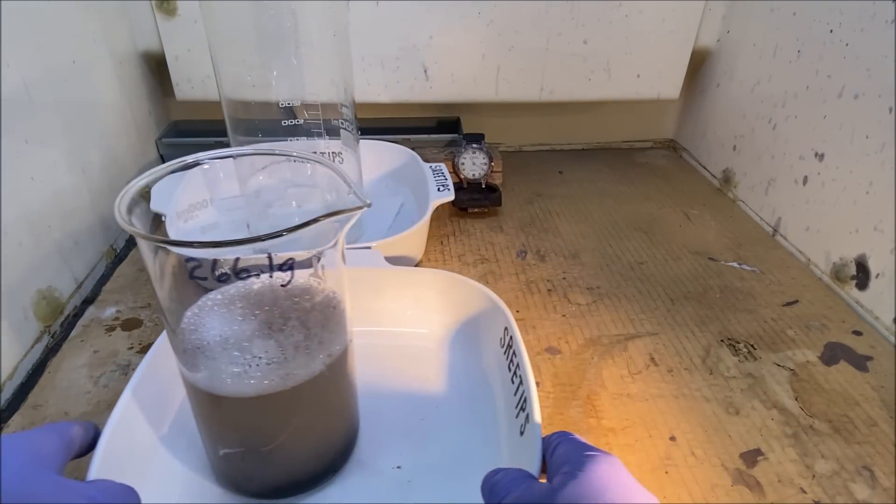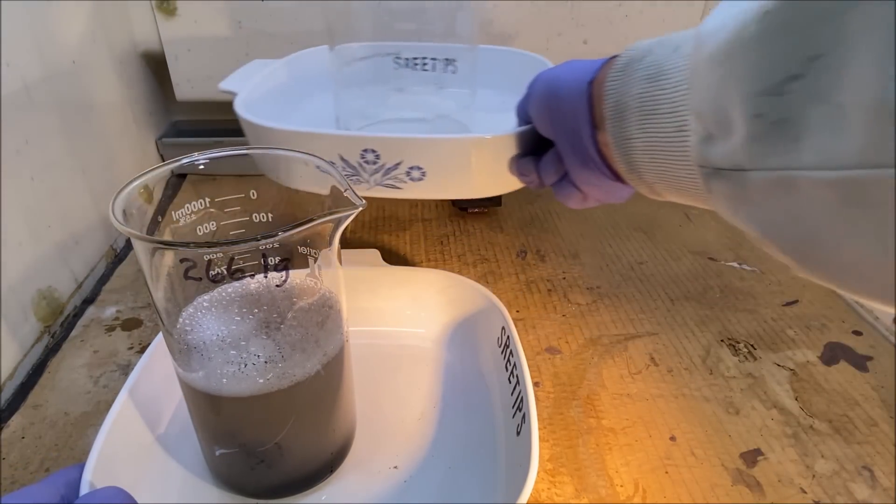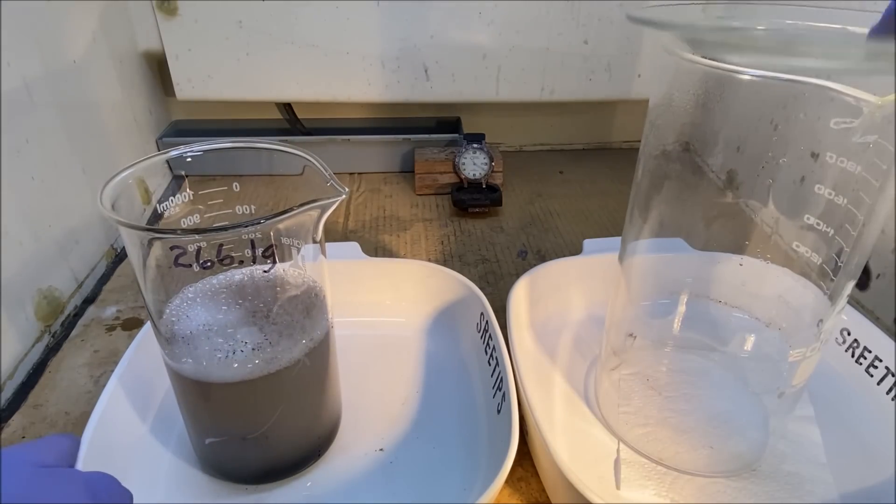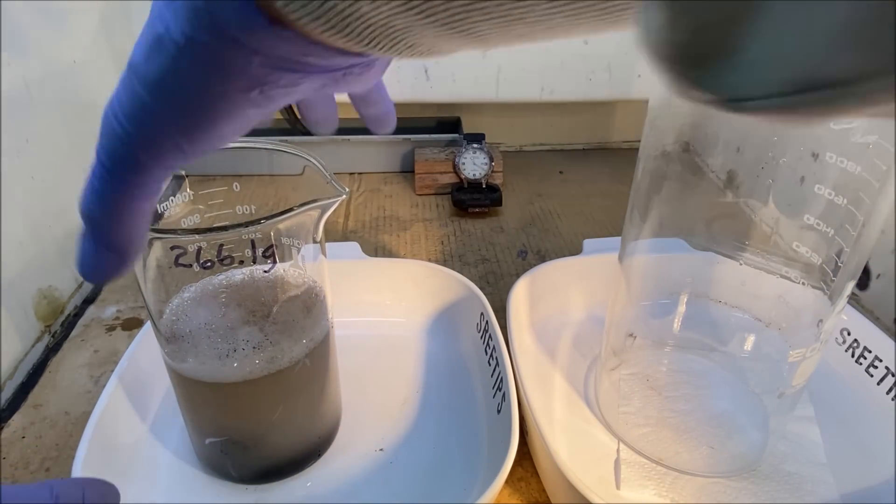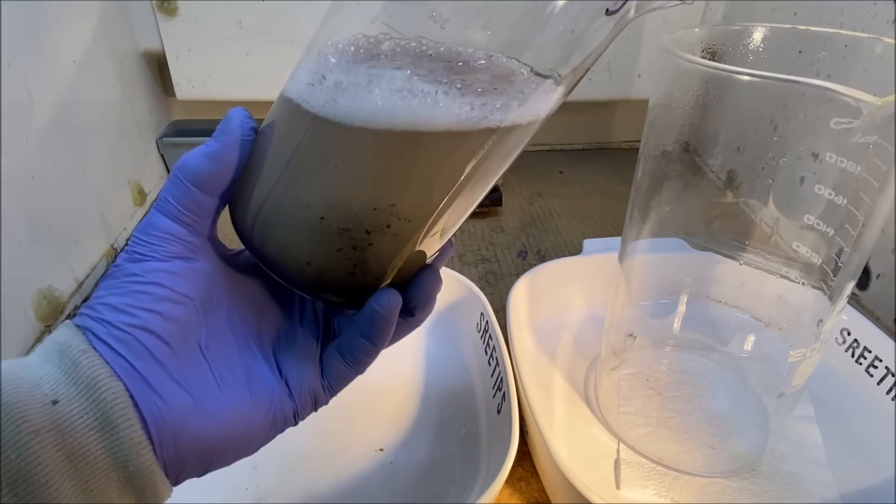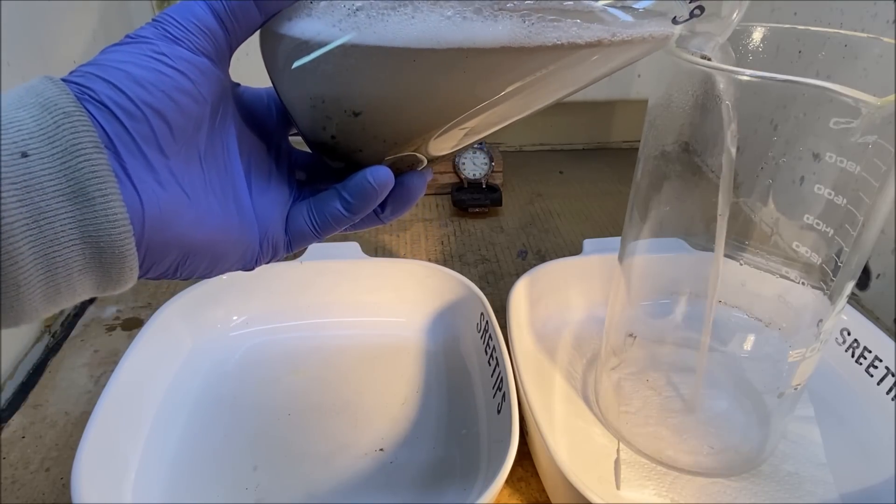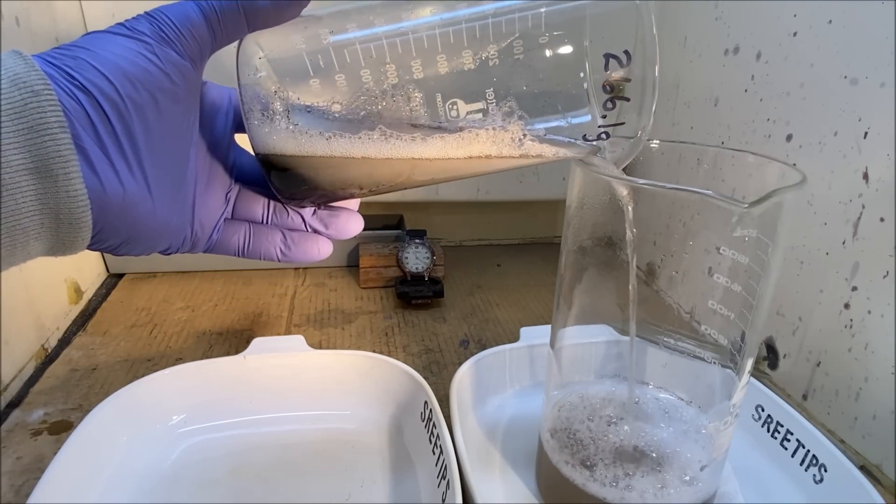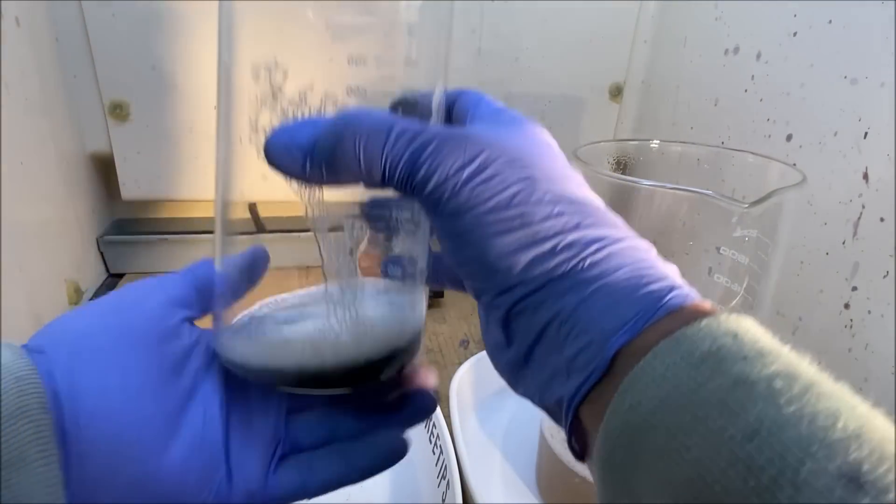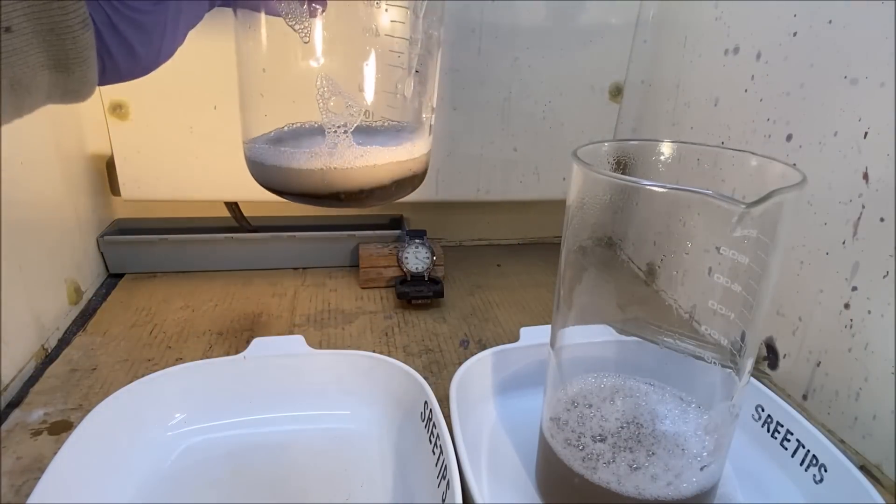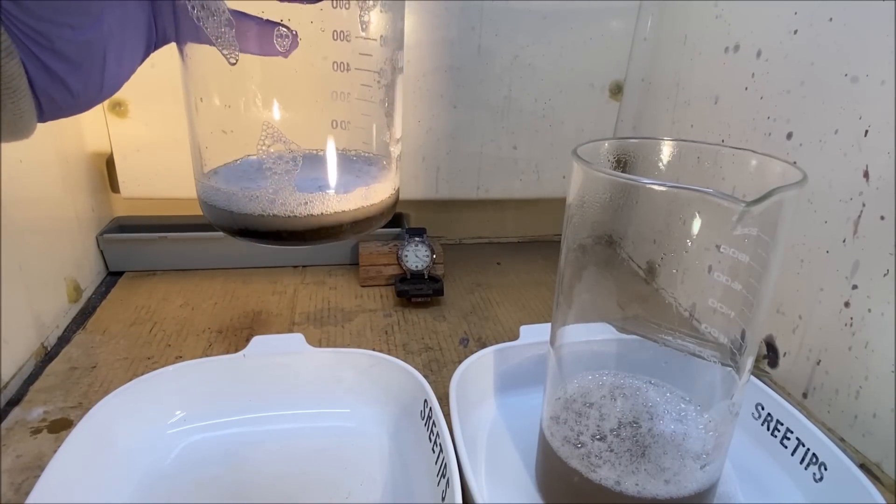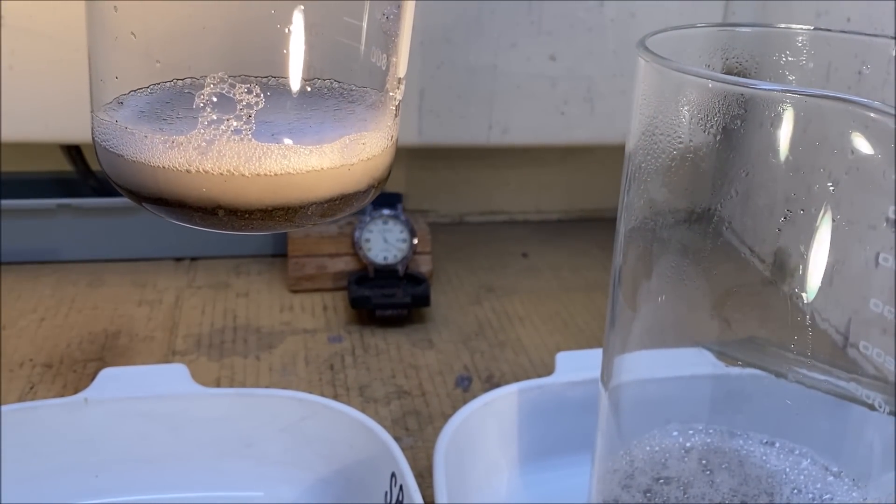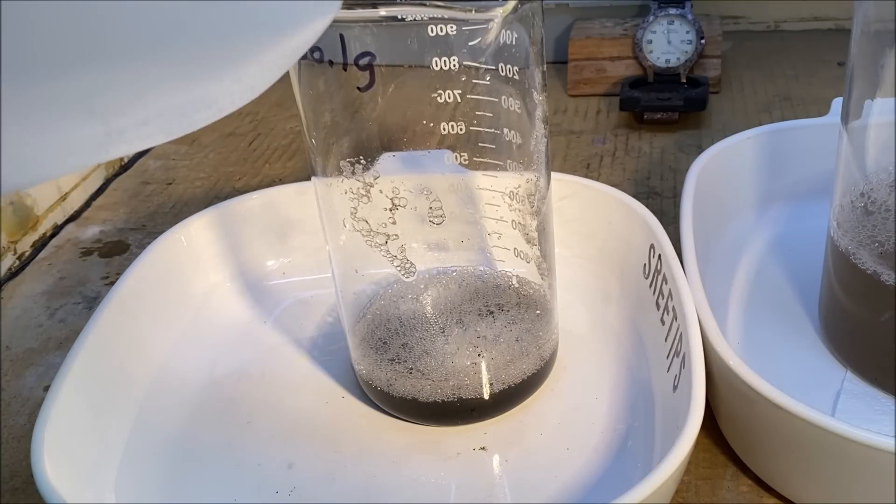I think you can see here that it's already starting to try to go back in solution in here. So I'm going to pour this liquid off of our metal, some of it anyway. Here's our metal down in the bottom of the beaker. Not very much. I'm going to add some distilled water to this.